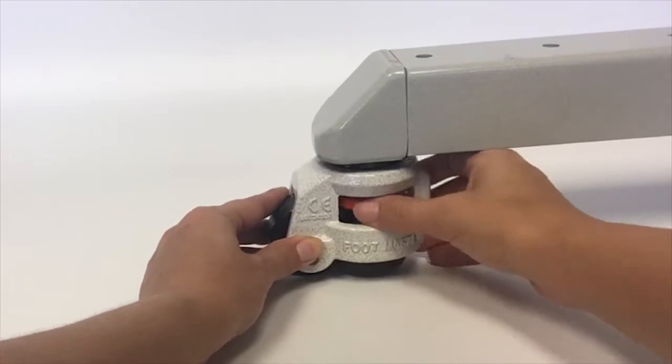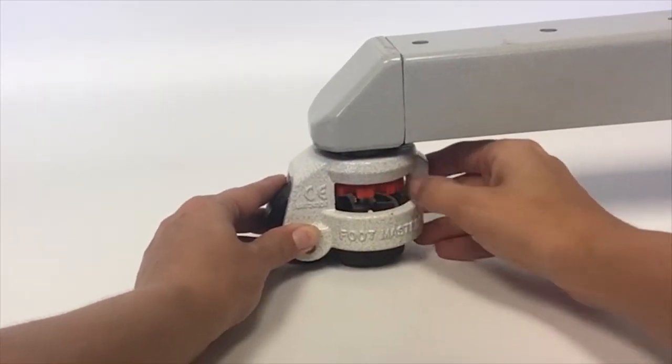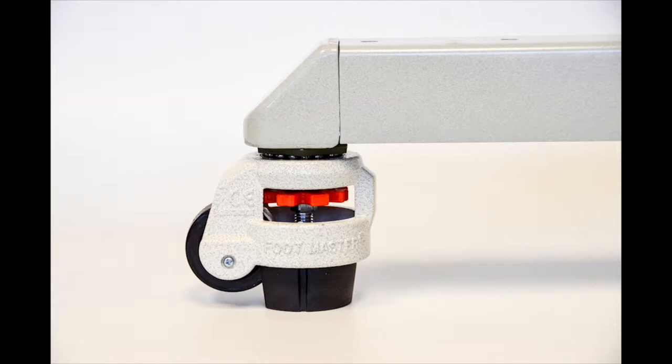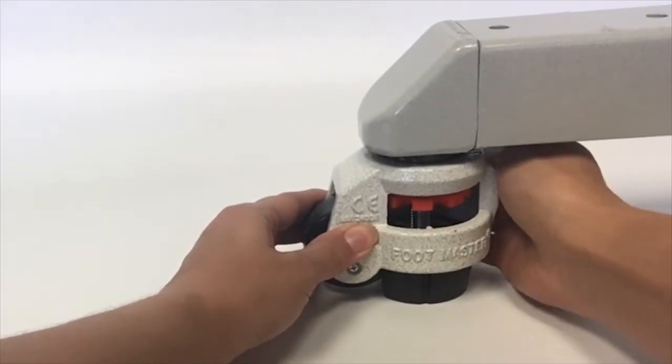Once assembled, turn the red thumb wheel to raise and lower the pad. This pad locks the caster and allows for leveling of the bench.